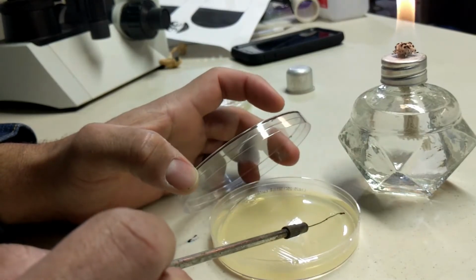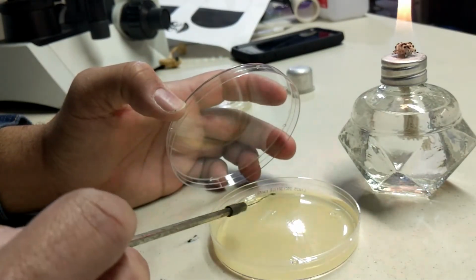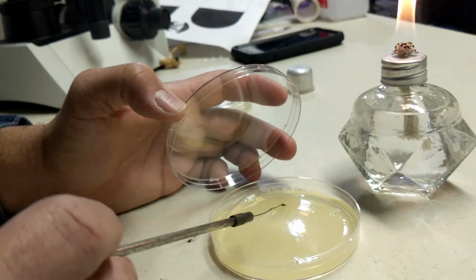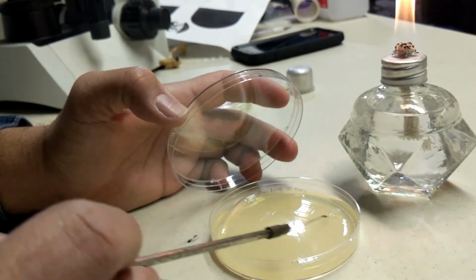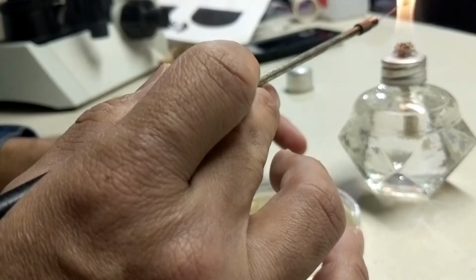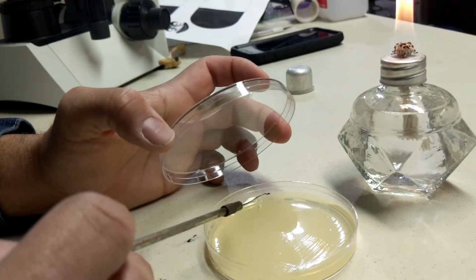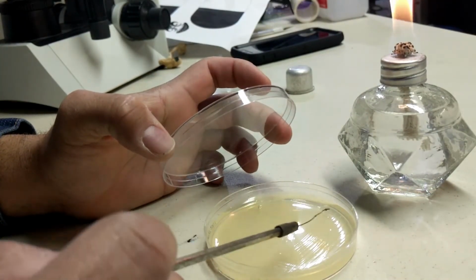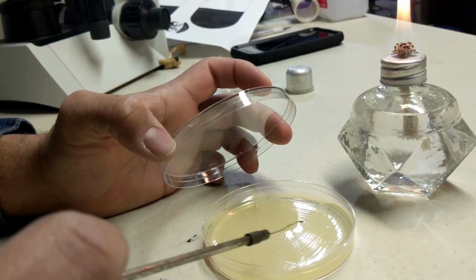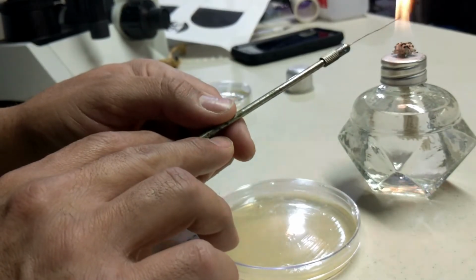You touch the agar in an area that there's nothing because you don't want to kill anything. And then you start to do the streak plate. 1, 2, 3, 4, 5. And then you spread and sterilize, and you do the same thing on the last quadrant. Okay? And that's it.